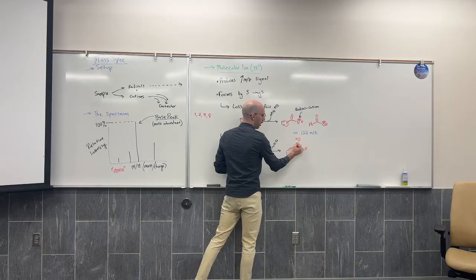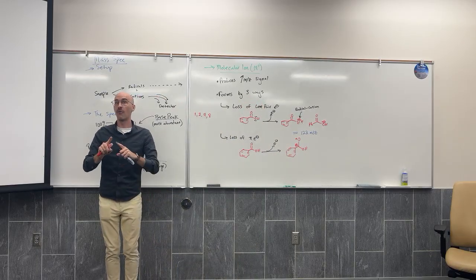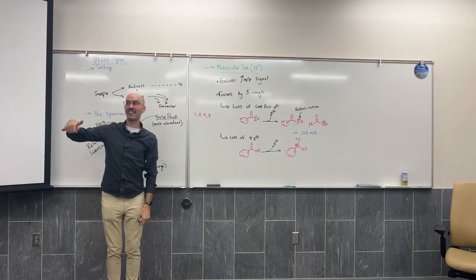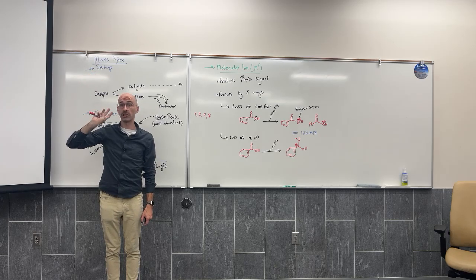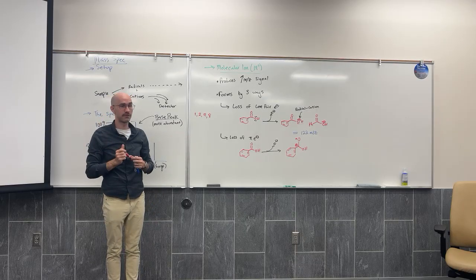So a radical on oxygen, which means carbon has lost one pi electron to the ionization and the other pi electron to electronegativity. You guys agree? Carbon essentially lost both of its electrons. So now carbon is sitting there with a positive charge.